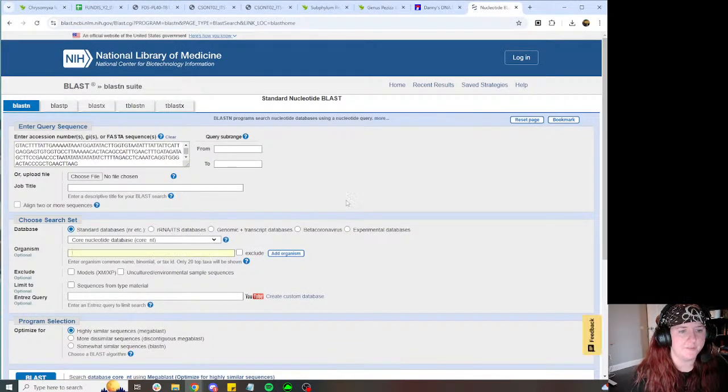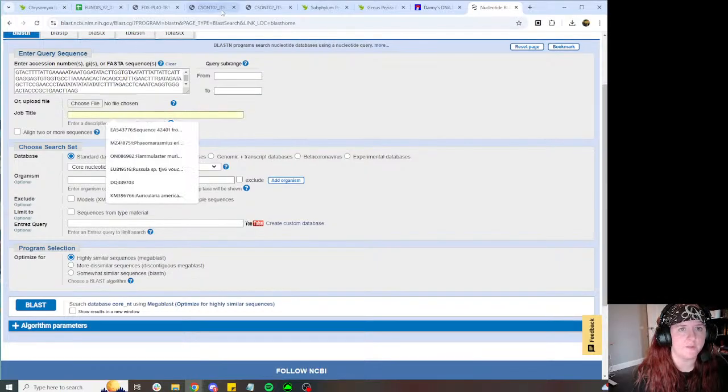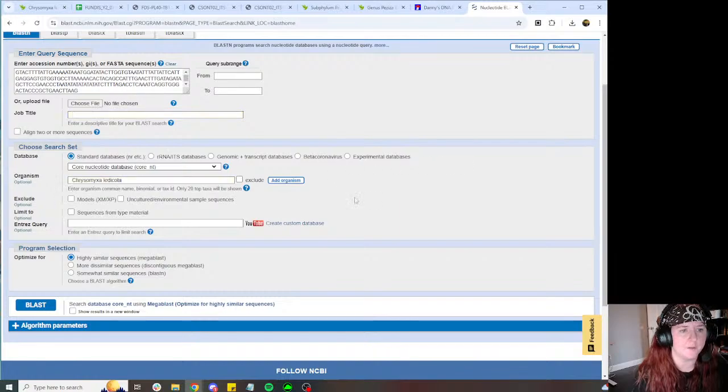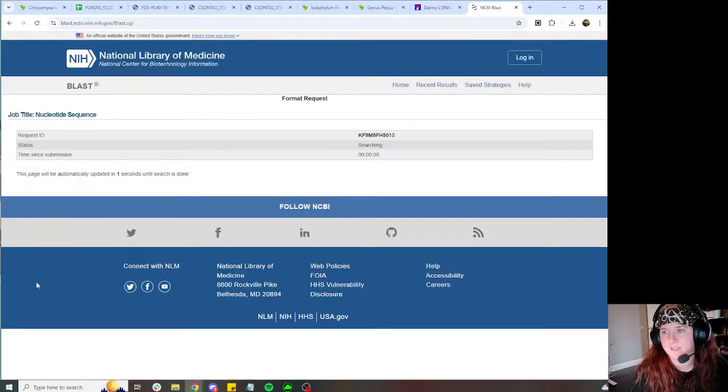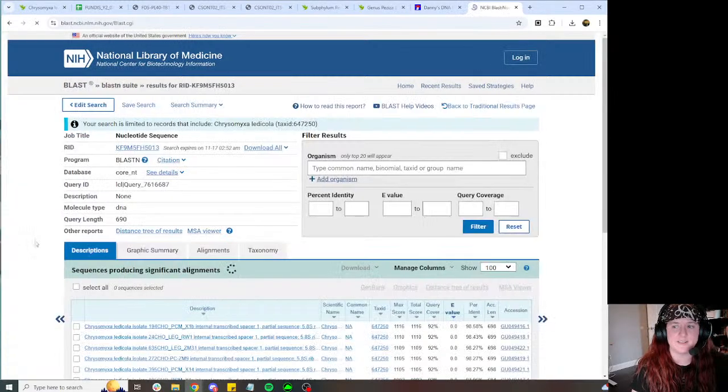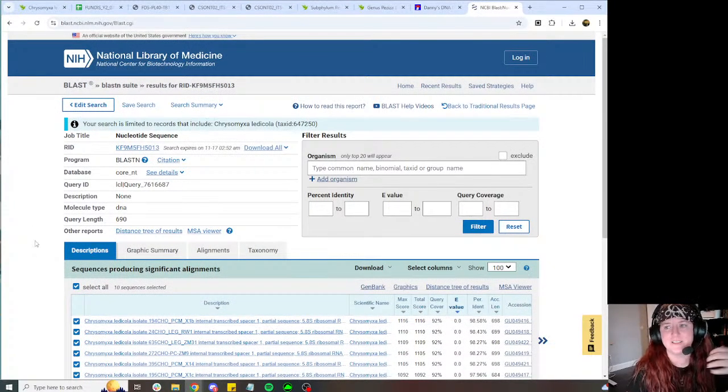But I always get suspicious of GenBank stuff because there is a preponderance of GenBank stuff that hasn't been well curated. So you'll have these dump taxa where they'll just say, oh, this is a super common genus name, obviously. And then there's a 10% spread in what the actual ITS is, and they're definitely not the same species.